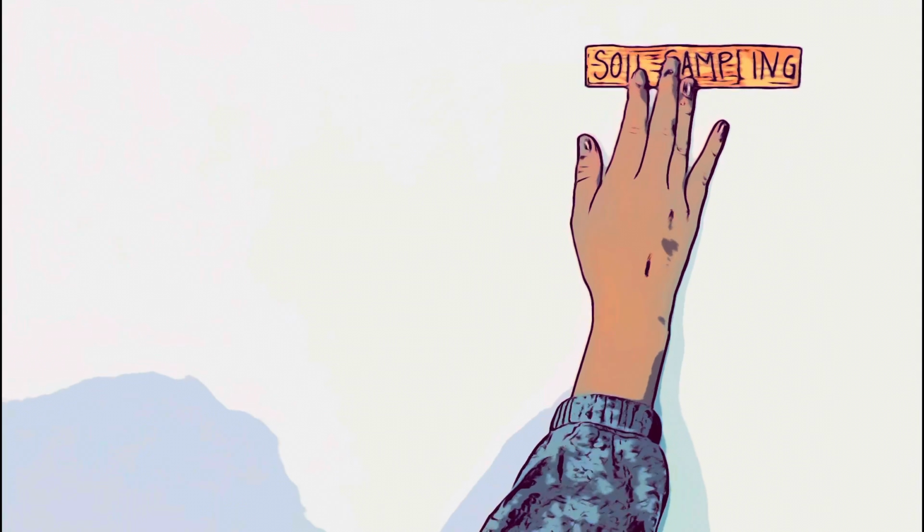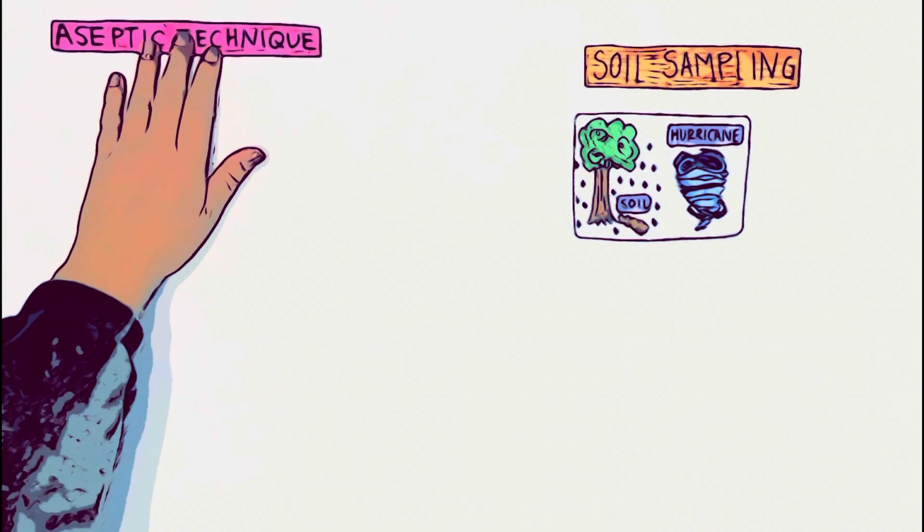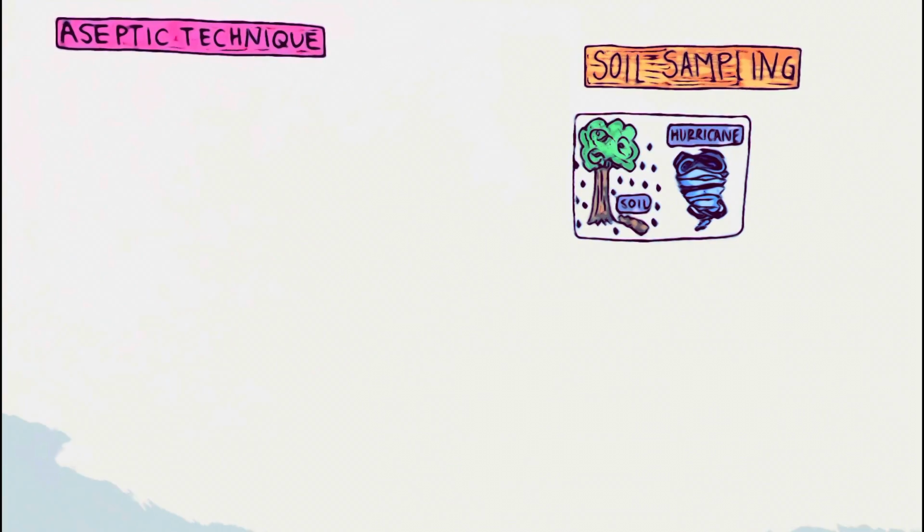Starting off with soil sampling. Soil harbors an abundance of microbial biodiversity. Local soils are rich and dynamic. They also remain uncharted in the lab. The goal of the soil collection is to test the uniqueness of the soil and how much we can discover from the microbial life of the local sample.